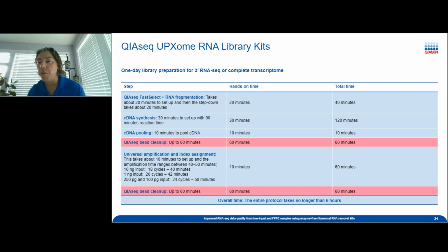By cDNA pooling, we can save up to 95% of the downstream master mix, beads, and plastics that are used within a workflow. Then we get into our first bead cleanup step, which takes about 60 minutes to do if you do it manually and take your time.